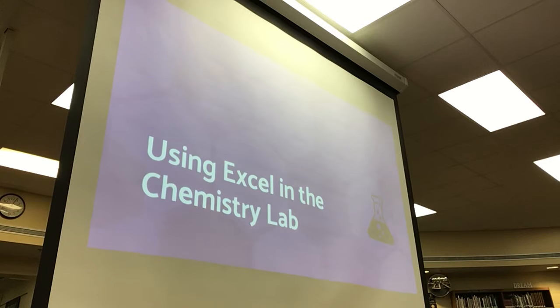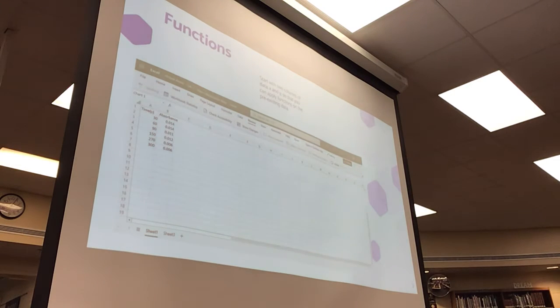Okay, so my name is Abby, and this is my presentation on how to use Excel in the chemistry lab. So if you want to follow along, you can enter these data points into Excel on your Chrome extension or on your desktop app.